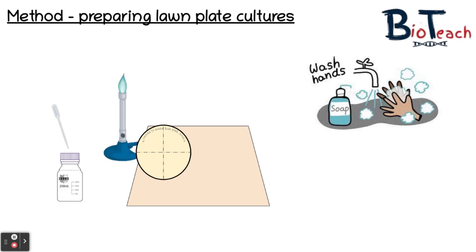Once you've got your pipette filled with around 0.3 to 0.5 centimetres cubed of the broth culture, you will lift the lid of your petri dish — not completely, just about half to three quarters of the way — and decant the contents of the pipette into the agar plate right next to the Bunsen. You will use your dominant hand to squeeze two to three drops, or perhaps the entire content if your teacher directs you, while using your non-dominant hand to lift the agar plate lid. Once emptied, you close the lid of the petri dish and immediately place the pipette into a discard pot or some form of disinfectant.